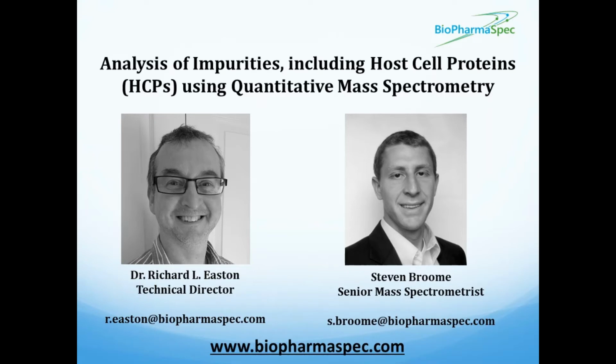Sure. Okay. So there's obviously good reason for analysing these things. Obviously, there's a huge range of molecules that people are working on. There's going to be a huge range of processes involved in producing these drugs, and that's going to give rise to a huge range of impurities, of course. So maybe you could say a little bit about the kind of impurities that we're working on, and some of the techniques that we use to analyze these.